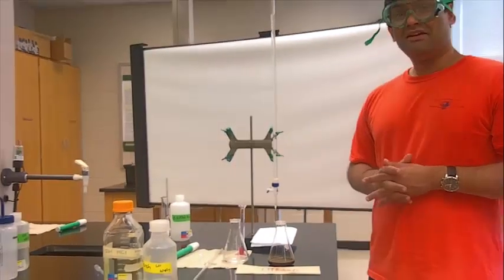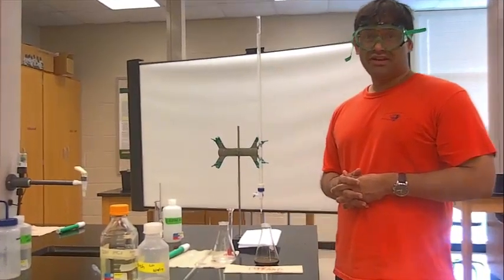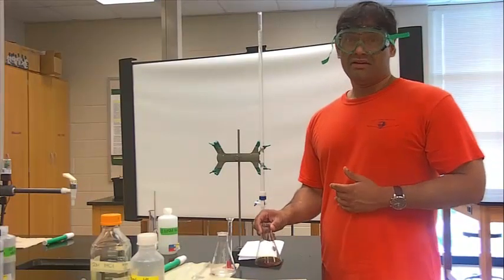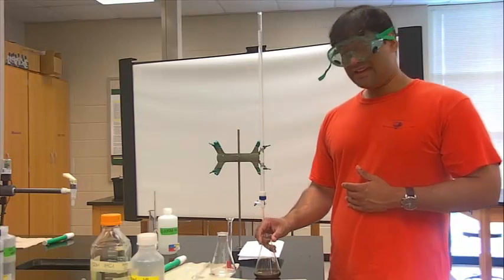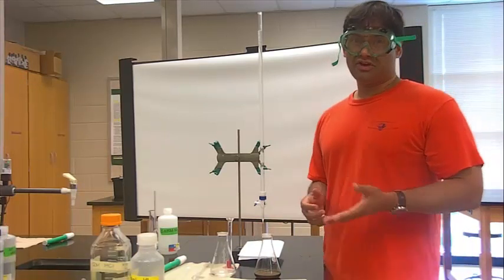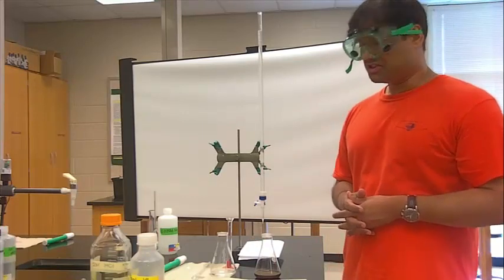You'll follow that up with what's known as the exact titration. In the exact titration, you'll go to about 1 or 2 mils before the equivalence point that you calculated in your trial titration, your first titration, and then 1 to 2 mils before that point, you're going to go very, very slow, drop by drop, drop by drop. That will be considered your exact titration.